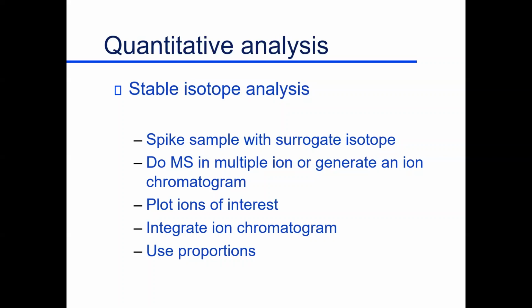So what we were doing, looking at mass spectrometry, different applications of it. And one of the places where we find it a good deal of use is quantifying things. That's actually a fairly simple task using a stable isotope. So instead of carbon 12, it's carbon 13, or a different isotope.